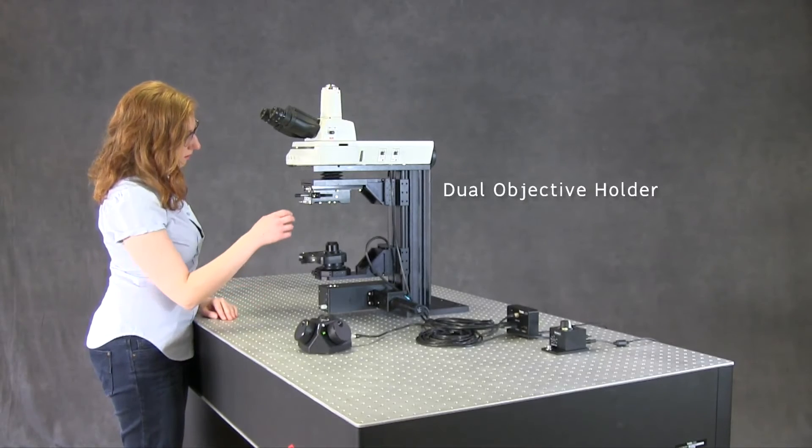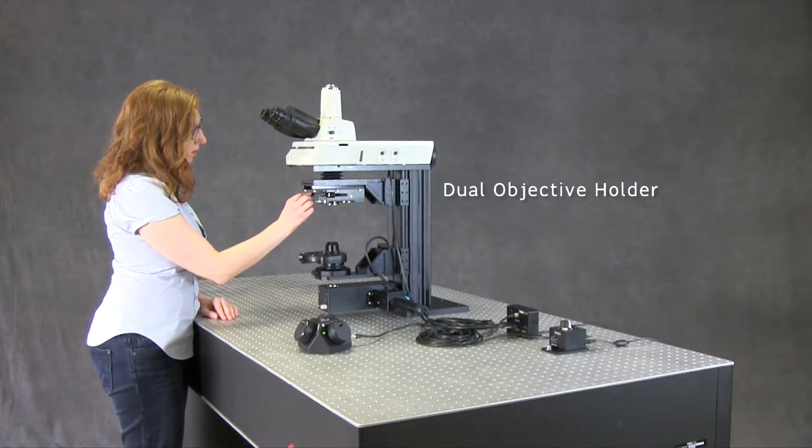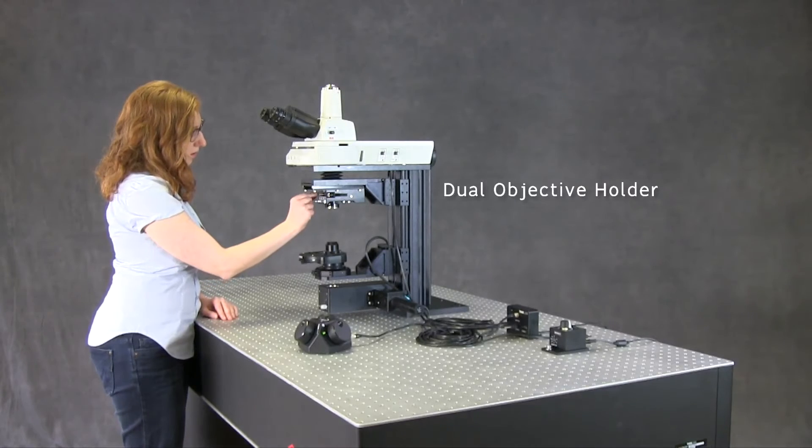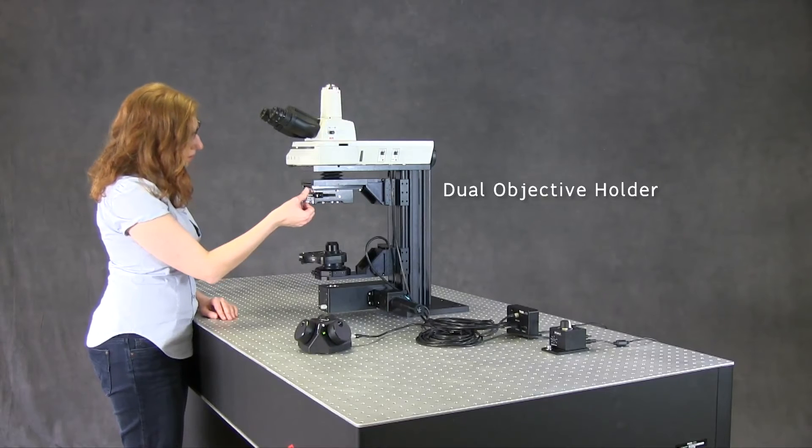This microscope is equipped with a dual objective holder, letting you use a low magnification objective to locate the region of interest, and then a high magnification objective to obtain high resolution images.